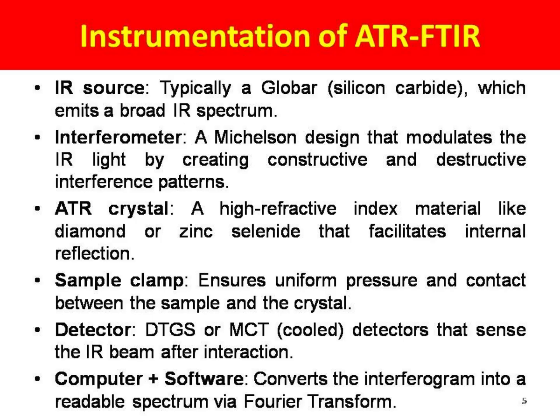The interferometer, that is a Michelson design, modulates the IR light by creating constructive and destructive interference patterns. The ATR crystal is a high refractive index material like diamond or zinc selenide that facilitates internal reflection. To hold the sample, uniform pressure and contact between the sample and the crystal are applied.